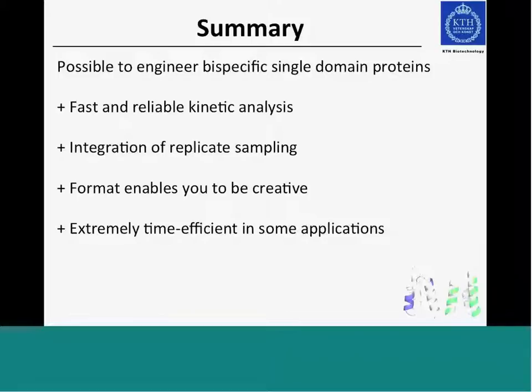That depends a little bit on how you define it. In the evaluation experiment which I showed you with the growth factor, it's very time efficient. You get a lot of replicates quickly. If we would do the same thing one injection at a time, we would probably spend days or even weeks getting that.